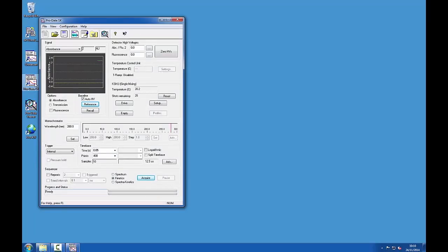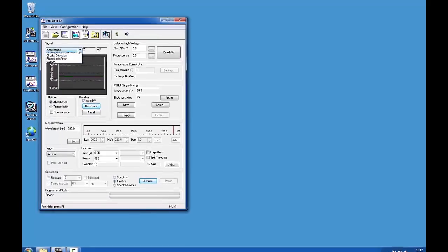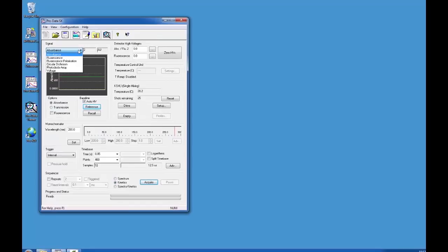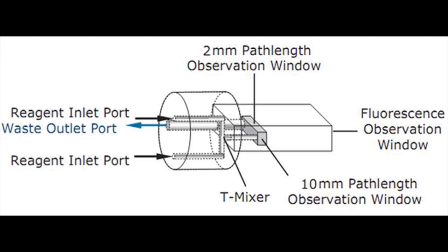We need to select the mode that we will be working in. For this initial example we shall make some absorbance measurements. We therefore want to ensure we have absorbance mode selected in the drop-down menu. We also need to select the path length.